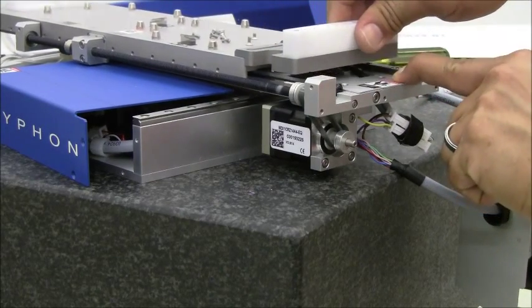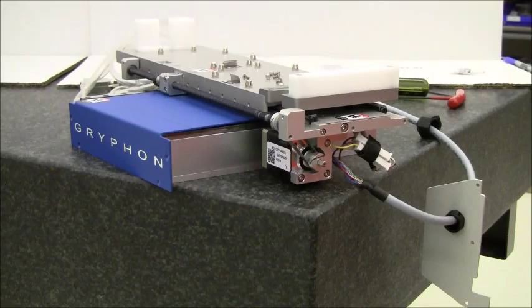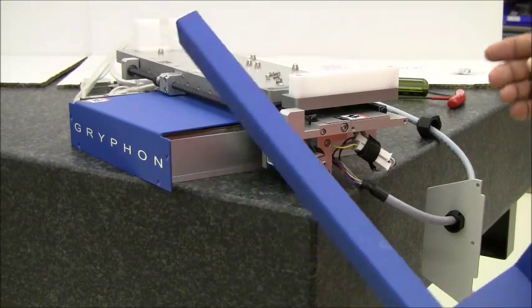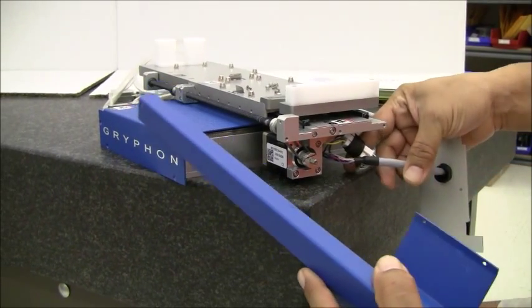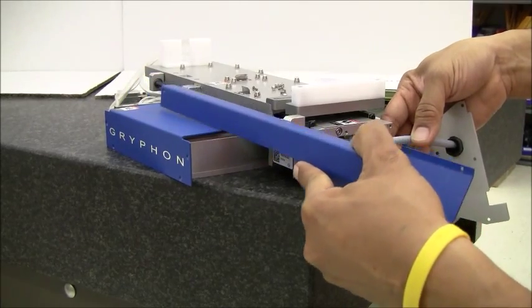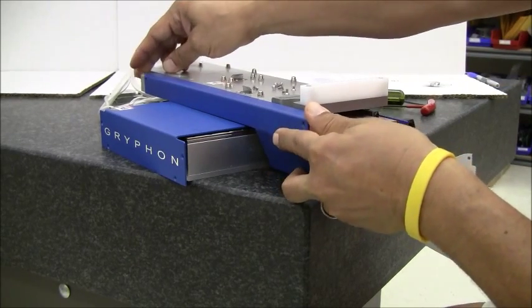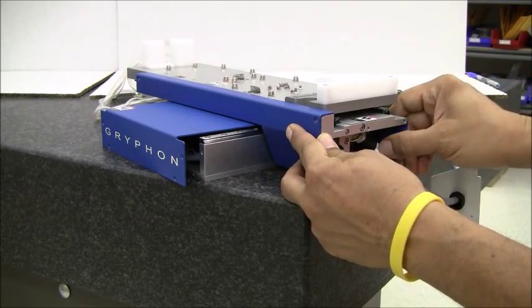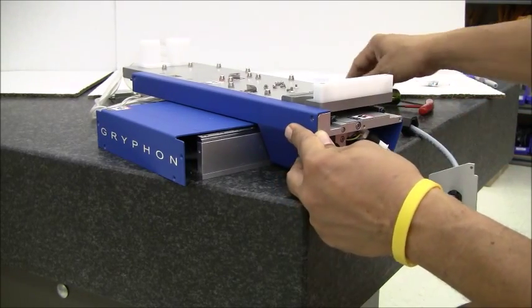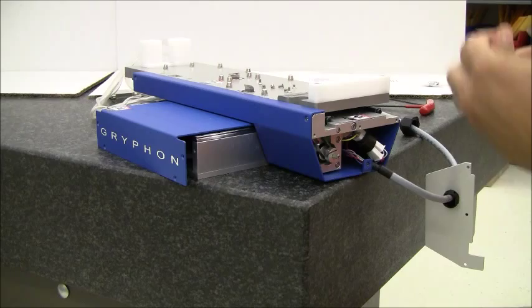The belt should be at the right tension. Installing the guard back on the stage — you have to make sure that you clear the cables and set it on the support brackets. Make sure that the cables are snug in there and then fasten the guard back on.